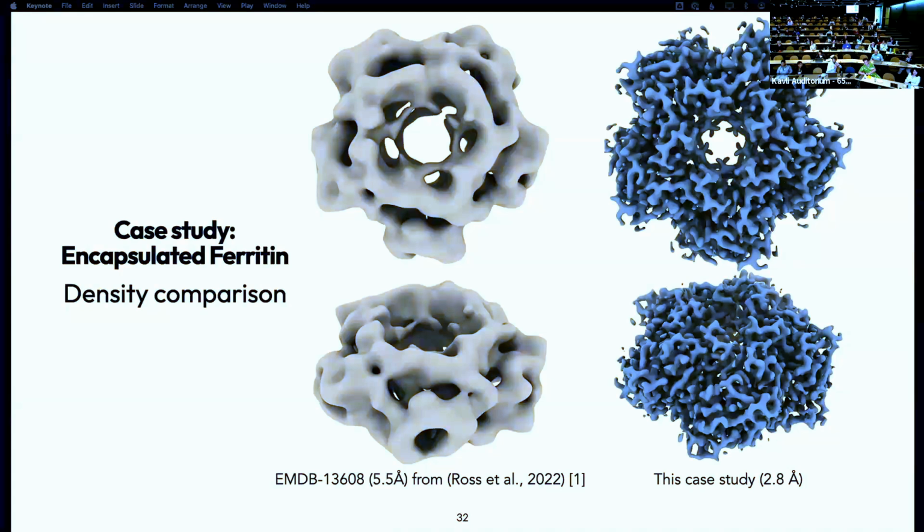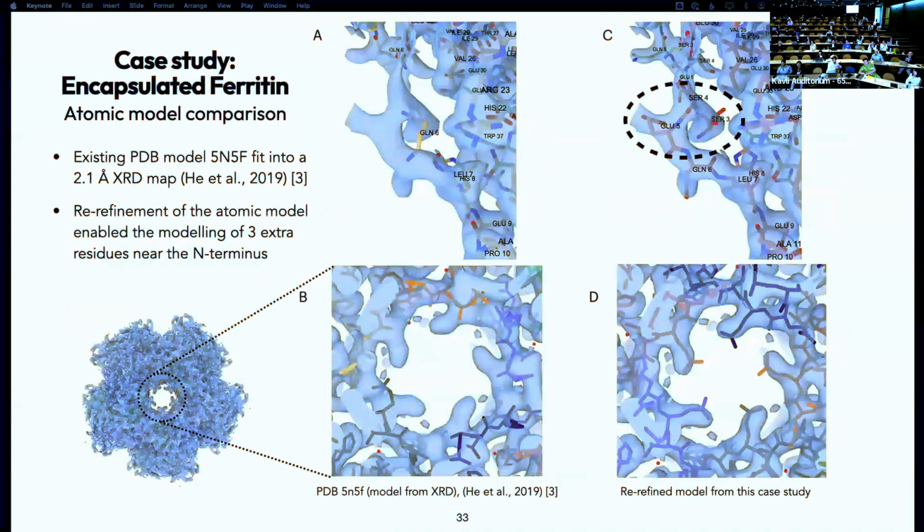Yeah. So there's actually one thing that I skipped over for time. There was a similar crystal structure on the PDB that the authors originally used to compare their structure to.